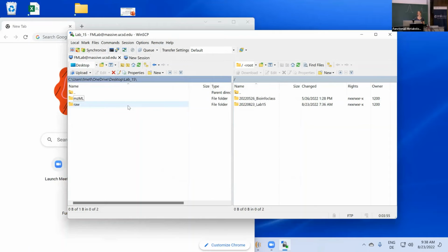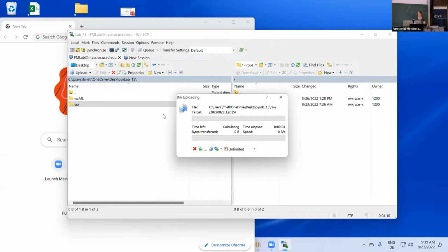Yeah, there has been a very important update recently. So that only applies to public data. So in your user account, where Allegra just uploaded her stuff, you have a quota of 100 gigabytes now. Because there was a problem that users would actually use this as data storage and not make it public, right? So they were just using the resource but not sharing. And that should be avoided with the new quota.